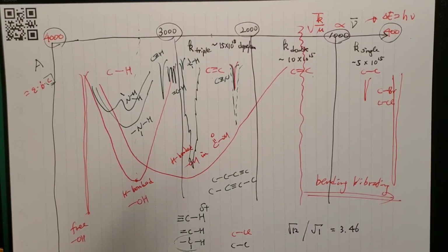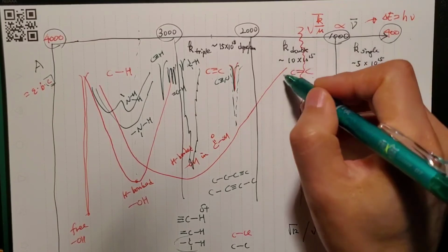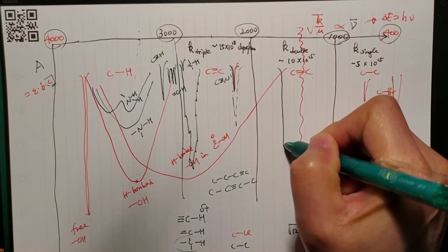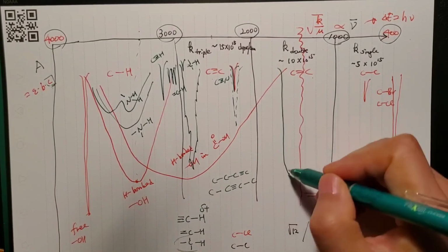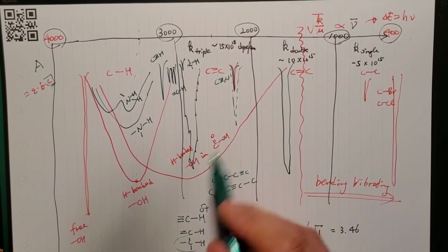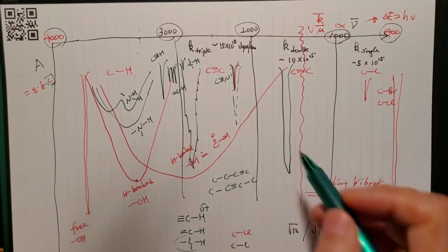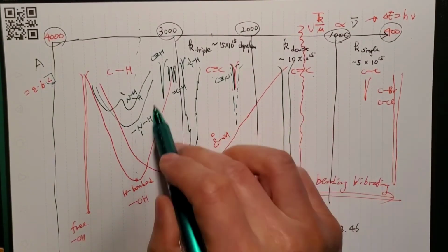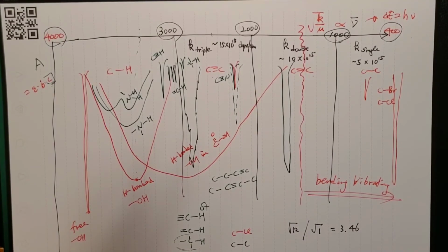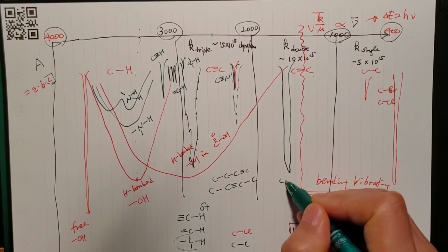So what are the double bonds you see in organic chemistry? Well, you see a lot of carbonyl groups, right? Ketone, aldehyde, ester, carboxylic acid, amide, all kinds. Carbonyl groups are polar, so it's going to be one of the strongest, most intense signals, but they're not as broad as the hydrogen ones, because they're not making hydrogen bonds as much. So it's not as sharp as these guys who never make any intermolecular interactions, but not as broad as the hydrogens.